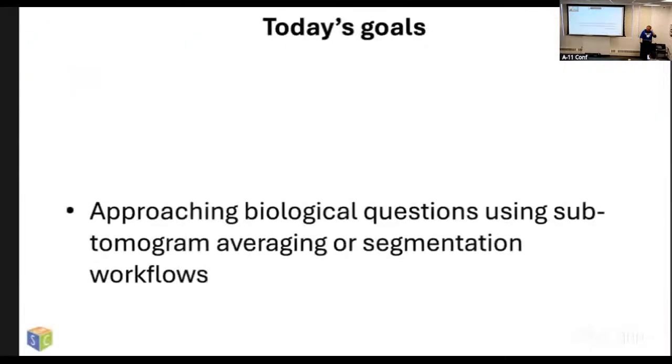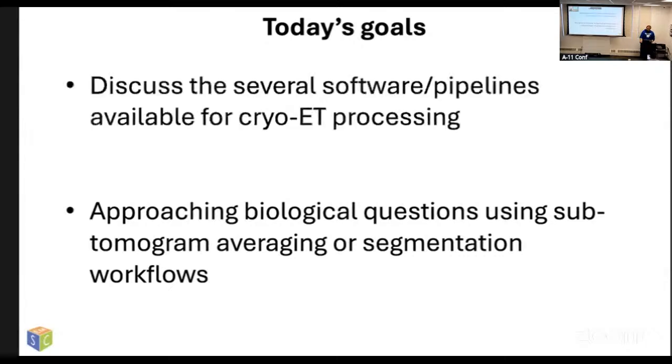One thing I'm going to talk about at the end is approaching different biological questions, or at least one of them, using either subtomogram averaging or segmentation workflows. And then I'll also discuss an overview of several software pipelines. This is something that's always constantly changing in CryoET, and it's kind of difficult to catch up with sometimes.